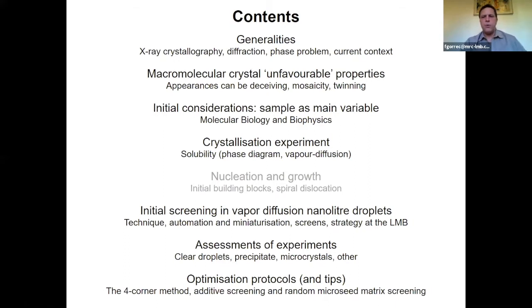I'm going to go through our main approach at the LMB, including our strategy, which is a large initial screen. Then I will go through some aspects of the assessment of your droplets. After a few hours and a few days, you will have a look at them under the microscope and see what you've got.